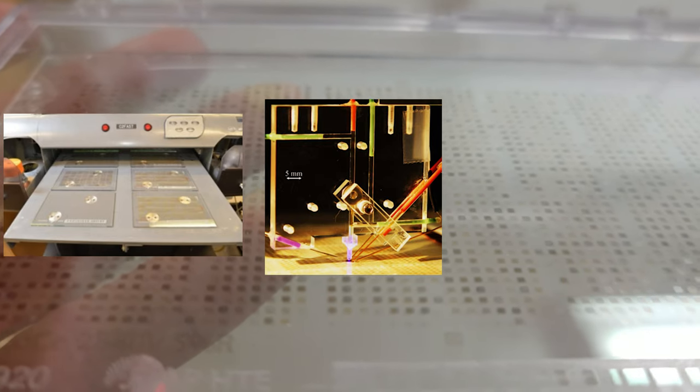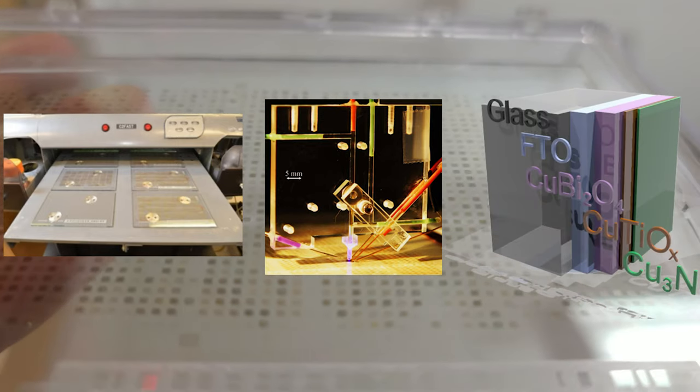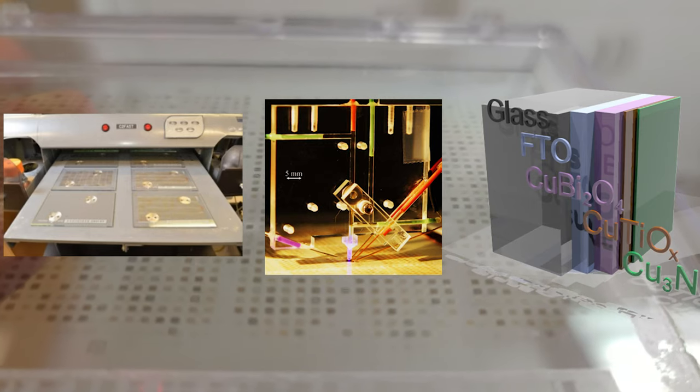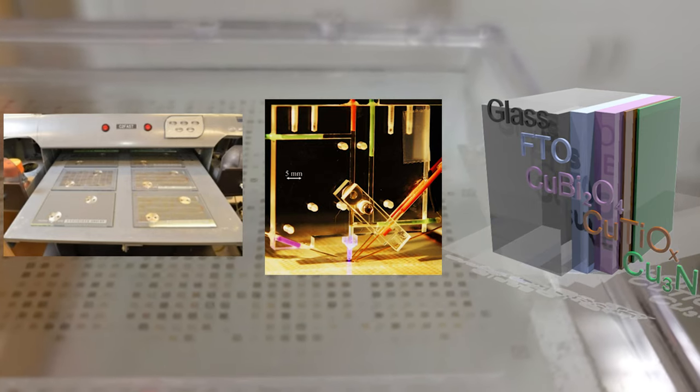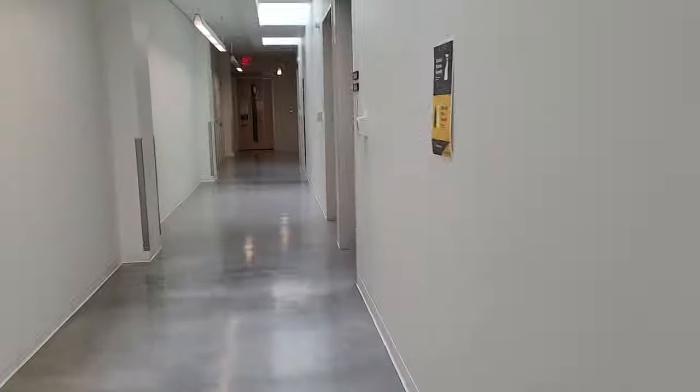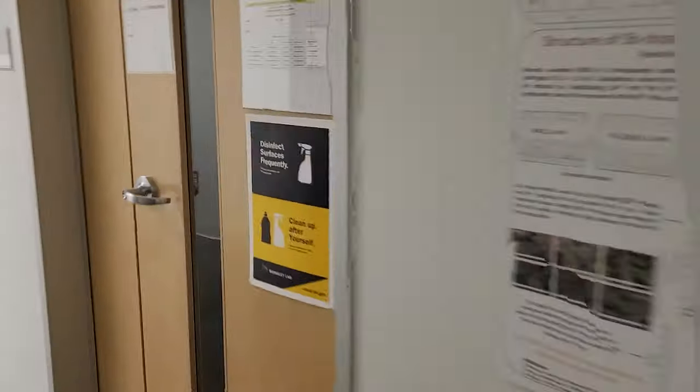These libraries can be deposited on known semiconductor substrates as well to identify catalysts which couple well electronically with the underlying semiconductor. Once an optimum material is identified, it can be scaled up using sputtering and further evaluated and tested using various laboratory experiments. Let's go take a look at some of the experimental techniques we employ to understand material properties.